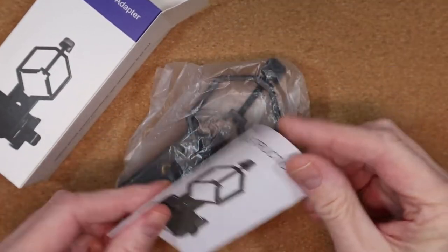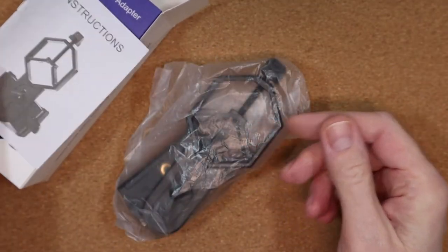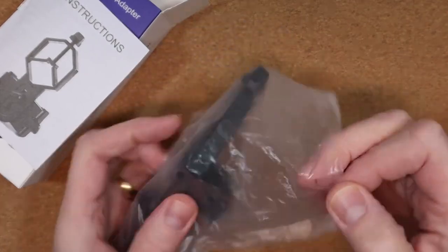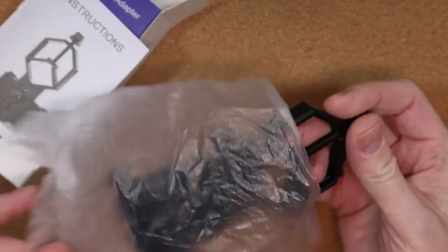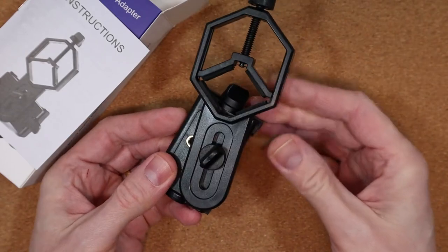Let's take a look inside the box. As well as the instruction booklet, we get the smartphone adapter itself which is made of hard plastic with soft foam and rubber sections to protect your smartphone and microscope, telescope or binoculars.